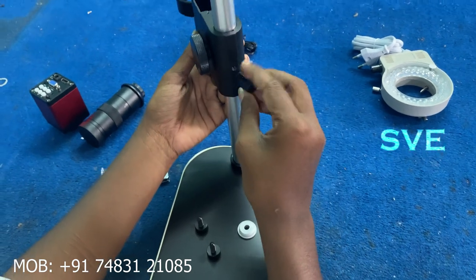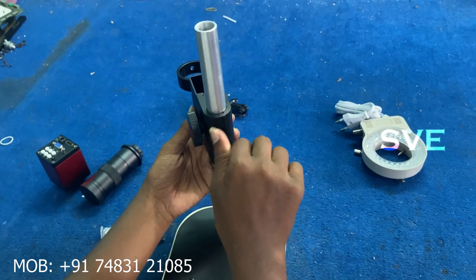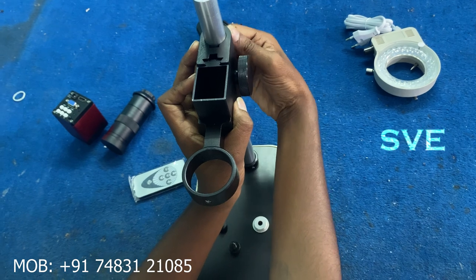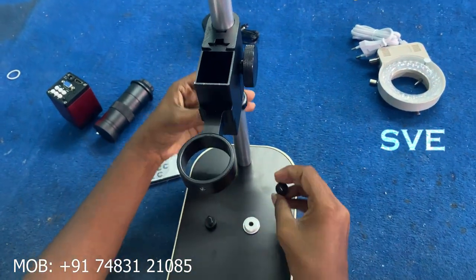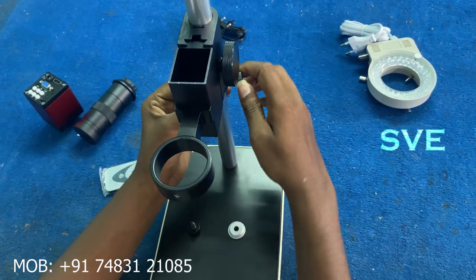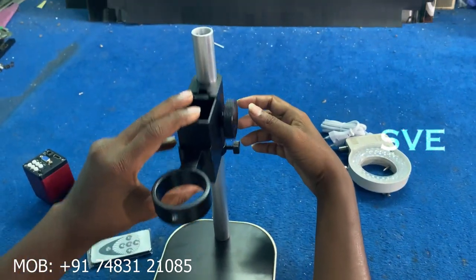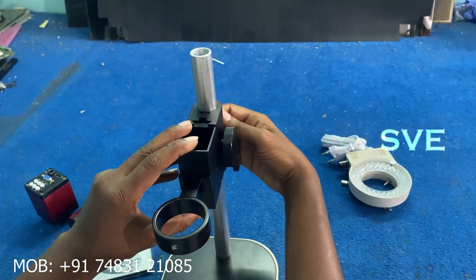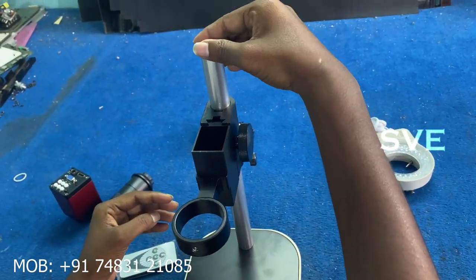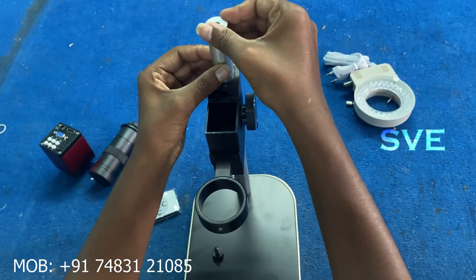Next I am fixing the microscope holder to that pipe. Next I am fixing the ring also. Now the ring works like a lock. Next I am fixing the top of this thread — it looks like a cap.